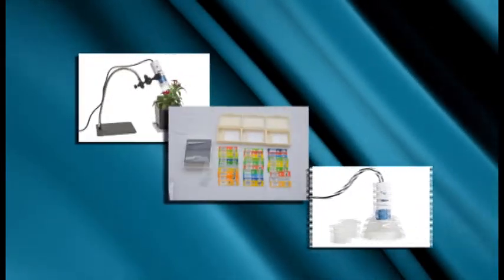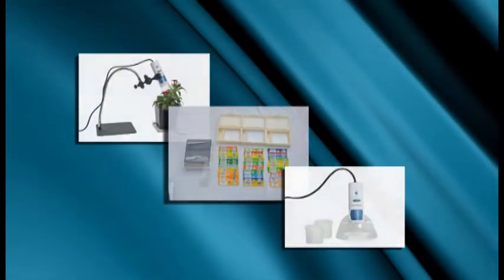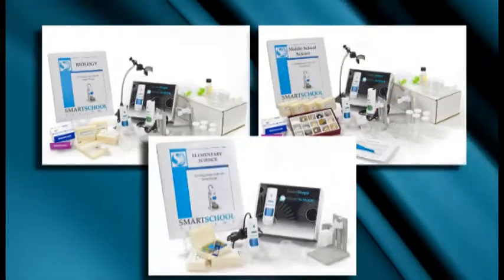We also offer additional accessories that make the SmartScope even more versatile, as well as complete educational kits with curriculum.